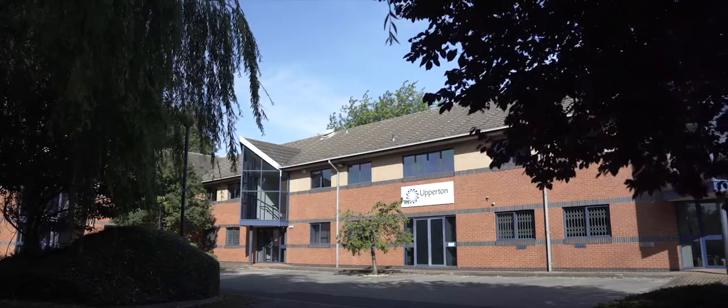Upperton Farmer Solutions is a contract development and manufacturing organisation based in Nottingham, England, and quite a lot has changed about the company over the last two or three years.